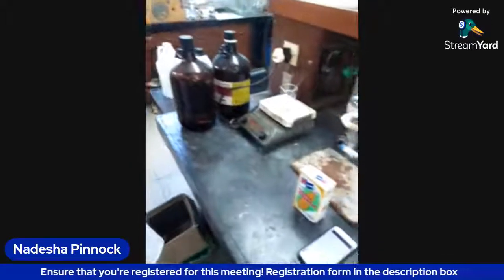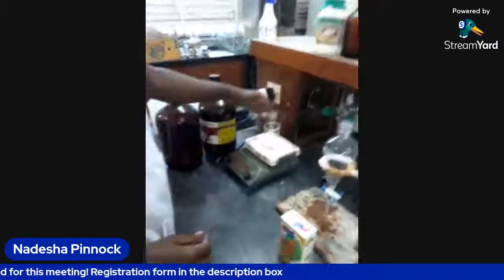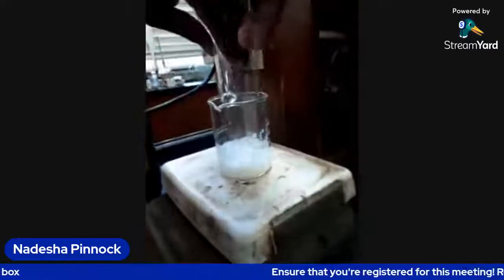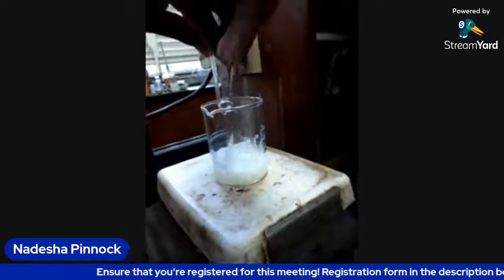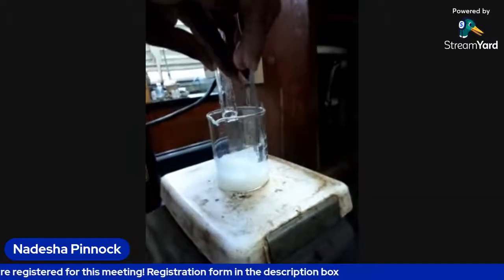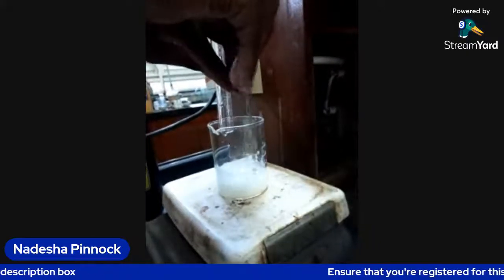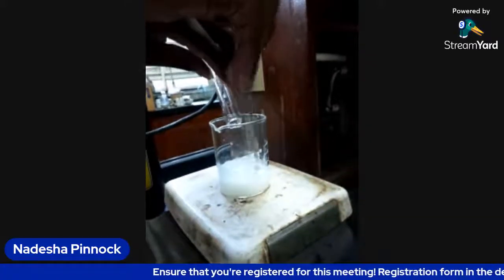Actually, we measured about 7.5. We're gonna add it. As you can see, the glycerol is very thick and syrupy. Glycerol in general is thick, but this is concentrated glycerol, so that makes it even thicker. It looks kind of like corn syrup, if you ask me.